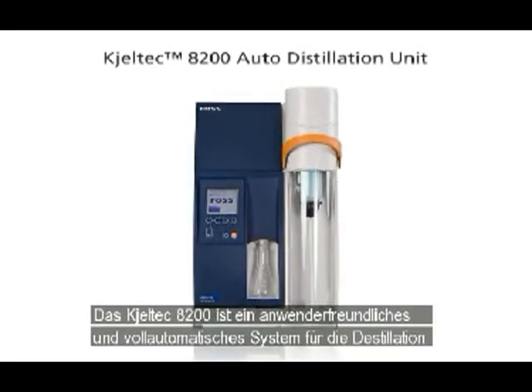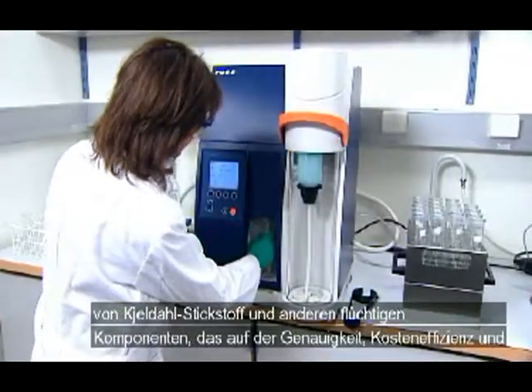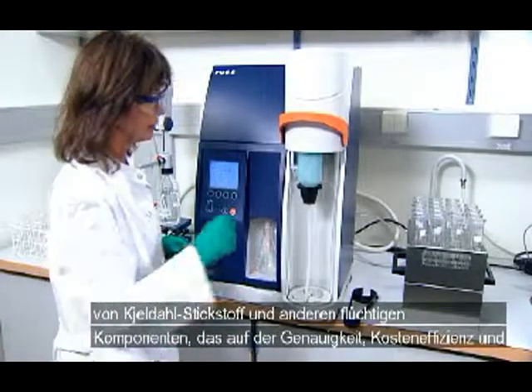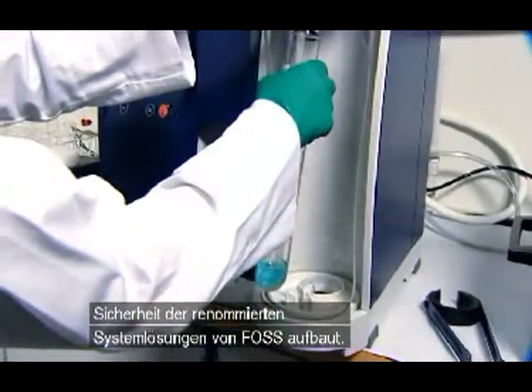The Kjeltec 8200 is a simple, fully automatic system for the distillation of Kjeldahl nitrogen and other volatile components, built on the renowned accuracy, cost-effectiveness, and safety of FOSS analytical solutions.